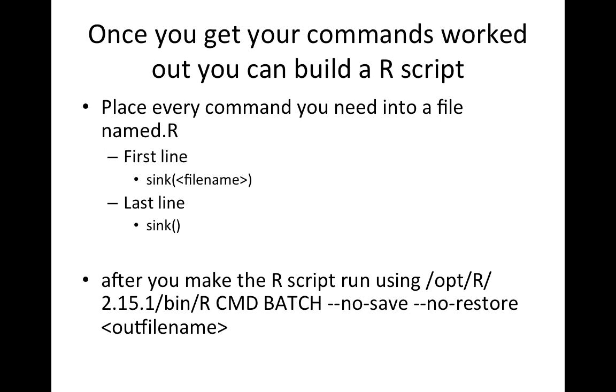So that's about the bare minimum you need to know about DESeq. If you're going to use it, make sure you read the manual. There's a lot more information in there. I wouldn't take this as a cheat sheet because my data is probably not like your data. So make sure you understand what it's doing and use it in the way built for your data.